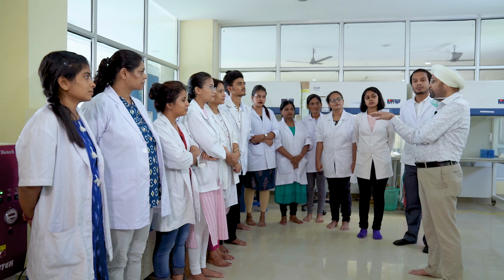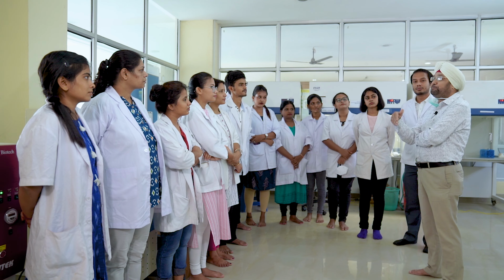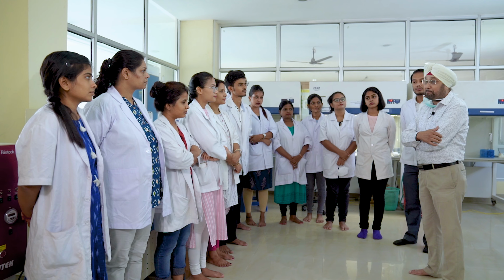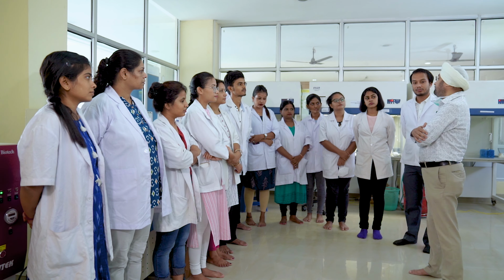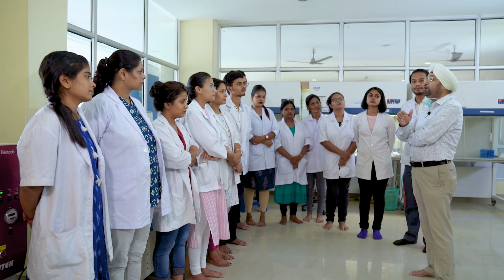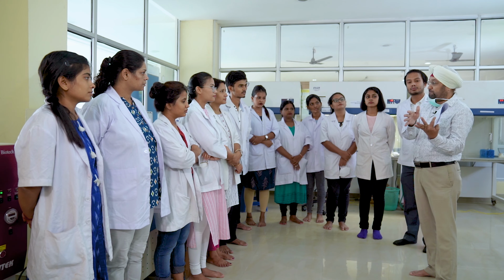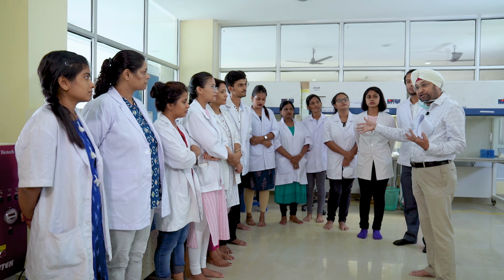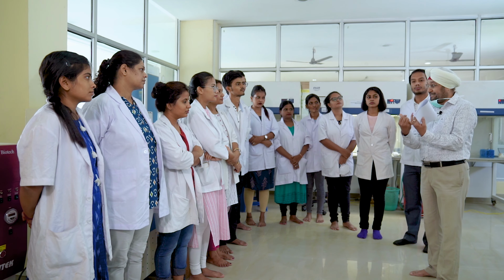So today we will demonstrate how we can produce transgenic banana plants mediated through Agrobacterium, using a very important explant which we call embryogenic cell suspension. We will demonstrate all the steps of the genetic transformation system, right from explant preparation, then how to induce the callus, how to induce the embryogenic calli, then how to establish an embryogenic cell suspension.